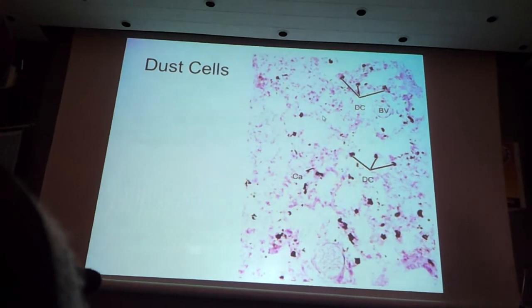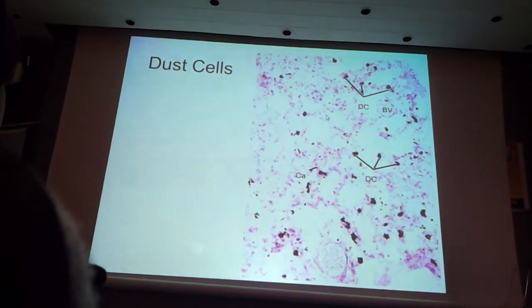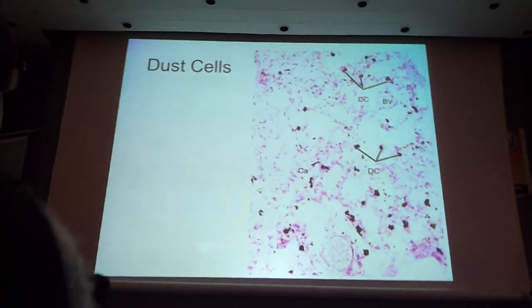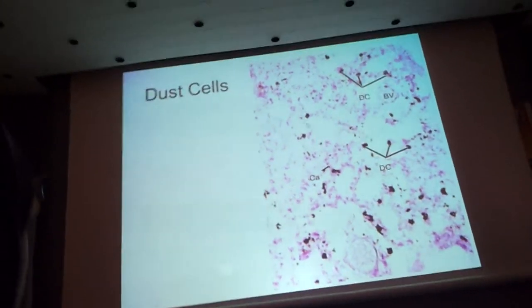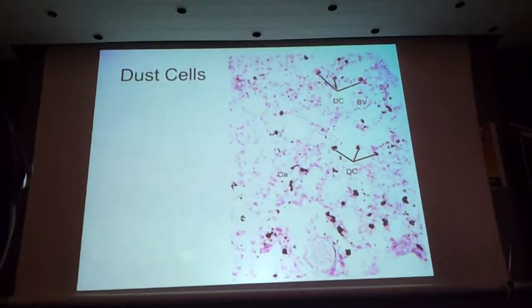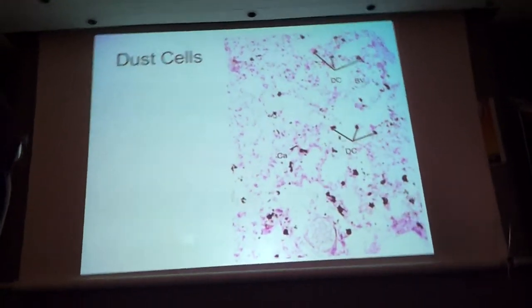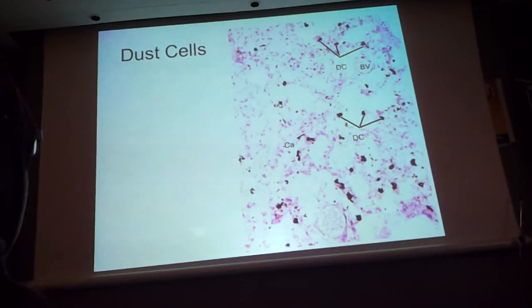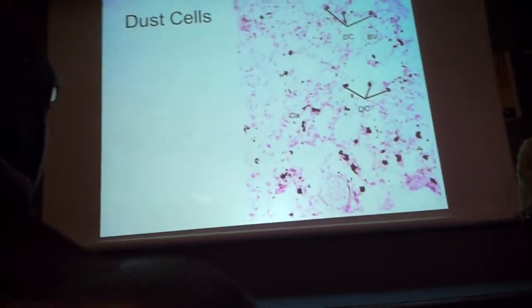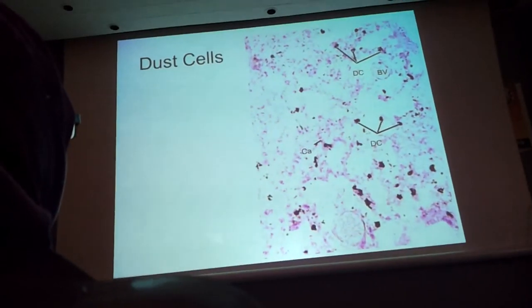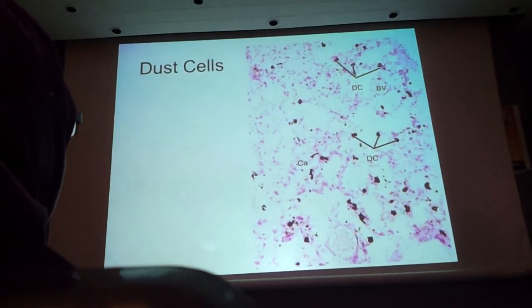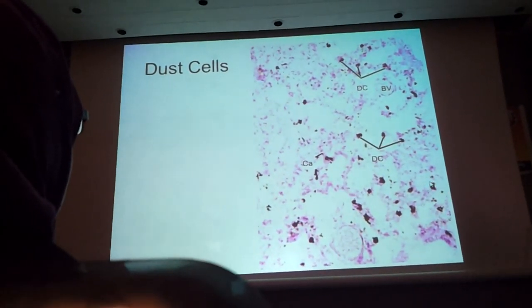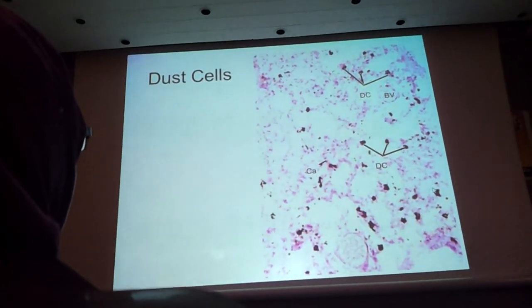The last thing to see is the macrophages — those appearing dark, which are referred to as dust cells in the lung. Those are the macrophages. The questions will come. Thank you.